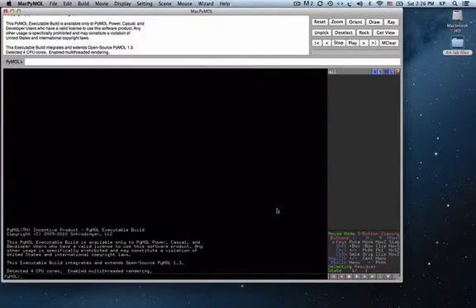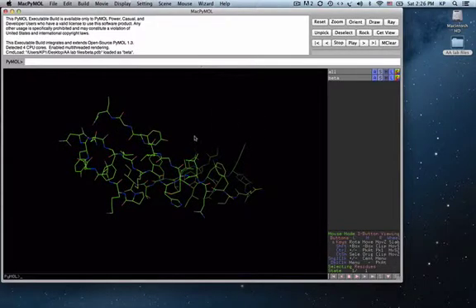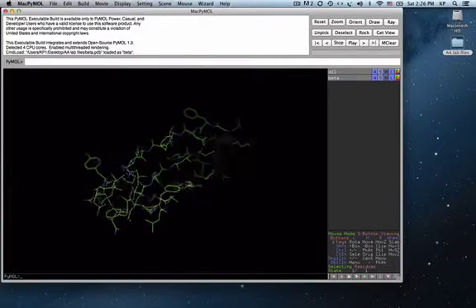I would like to go over some of the features from PyMOL covered in the video tutorial. Let's start by examining the beta sheet file that I've provided for you. Open the beta sheet, and by clicking, I can drag and turn this around.